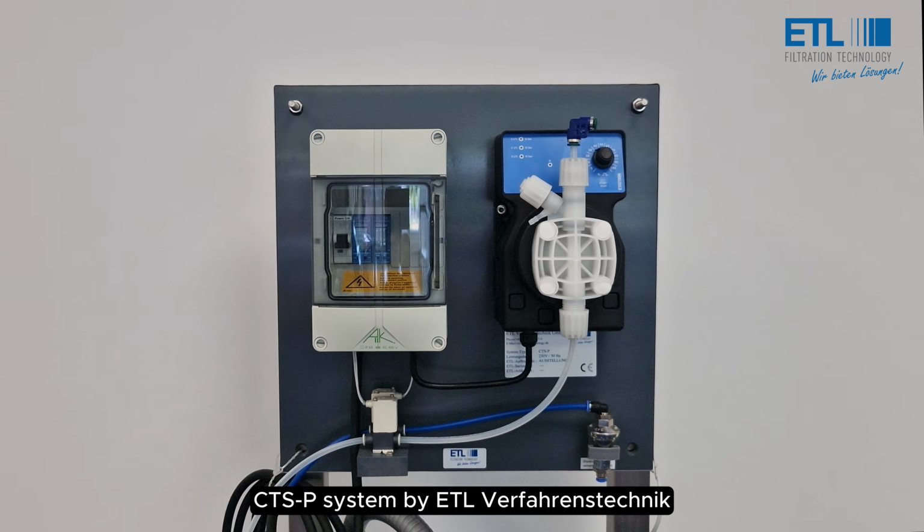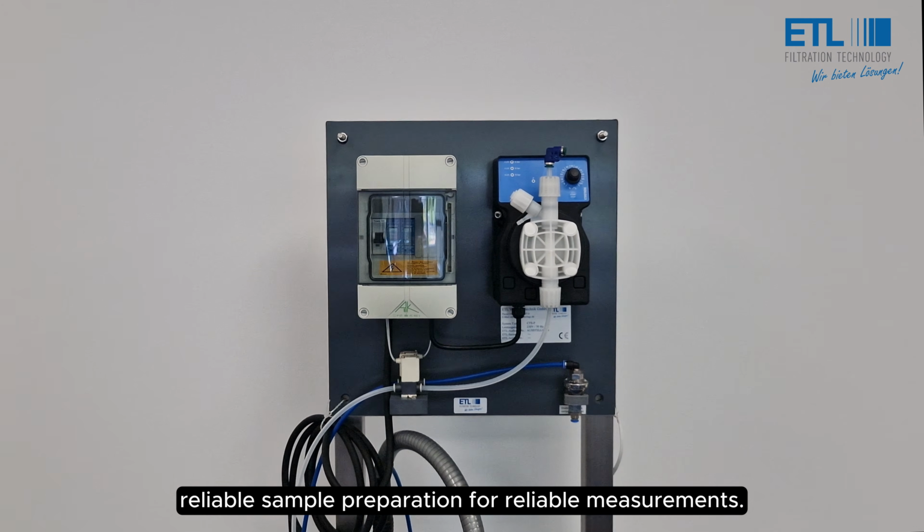CTS-P system by ETL Verfahrenstechnik: reliable sample preparation for reliable measurements.